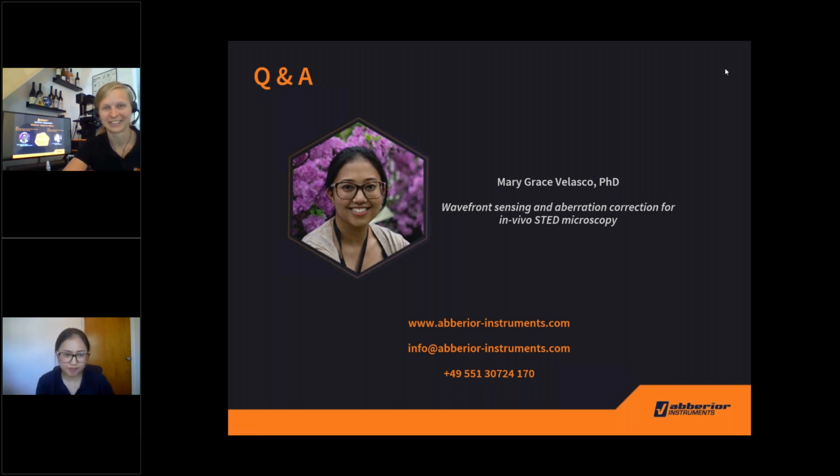Yeah, of course. We have not yet performed particularly quantitative tests for photo damage and phototoxicity for these experiments, though of course I definitely agree that such experiments should be included in any follow-up studies. But I will say this, there were a few design features incorporated into the microscope that correspond with published guidelines for minimizing photo damage specifically for live cell STED experiments. For this, I'm referring to a paper also from Jurg's lab.